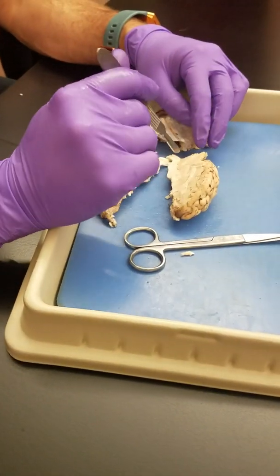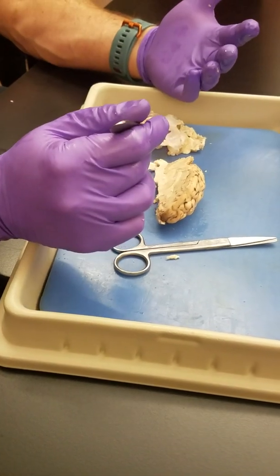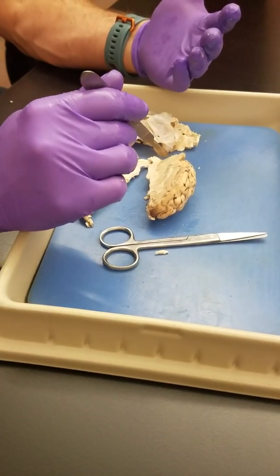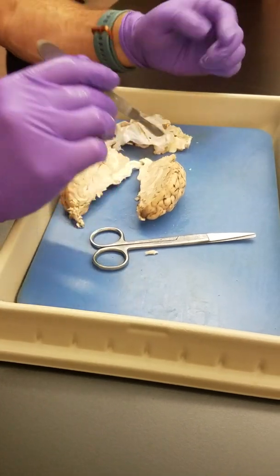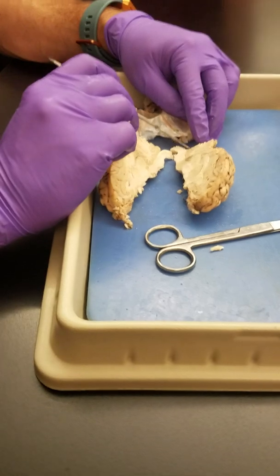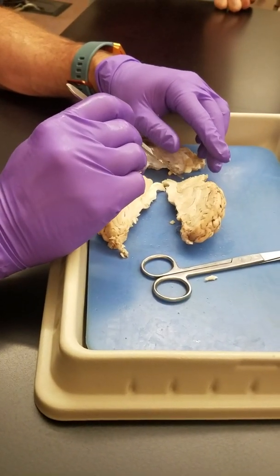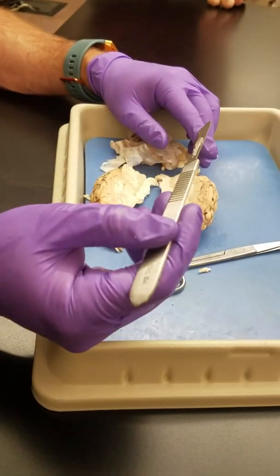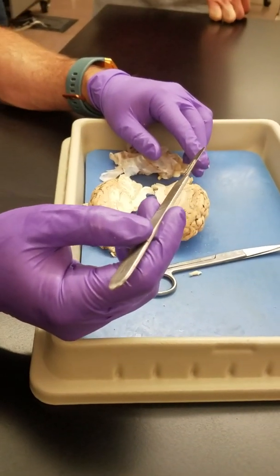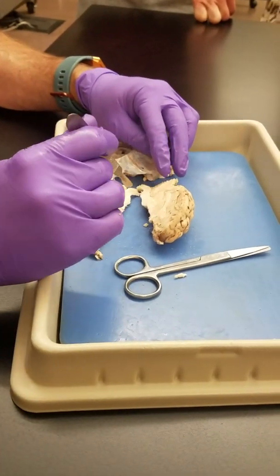Okay? Here is, again, the cerebellum. The function of the cerebellum is to help coordinate movement. With damage to the cerebellum, you're going to be a little clumsy. See this white tissue in the center? This myelinated tract in the center is known as the arbor vitae. Arbor vitae means tree of life. You guys heard of Arbor Day? What do we do on Arbor Day? We plant trees. So arbor means tree. So that's called the arbor vitae.